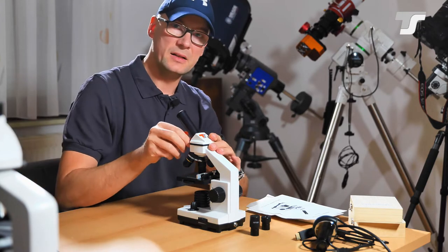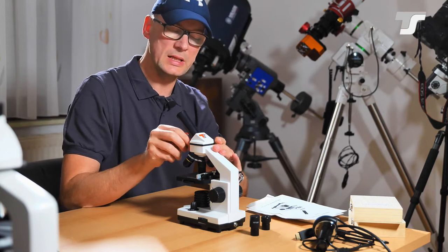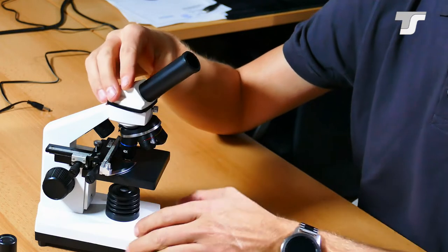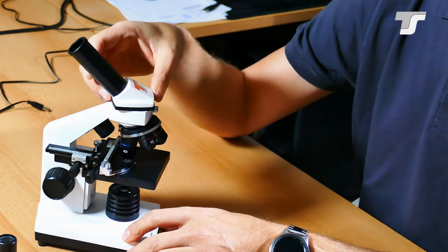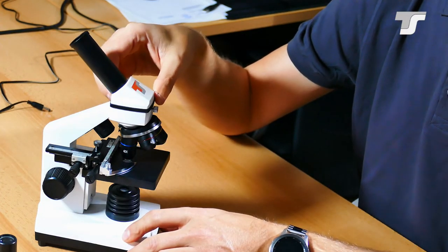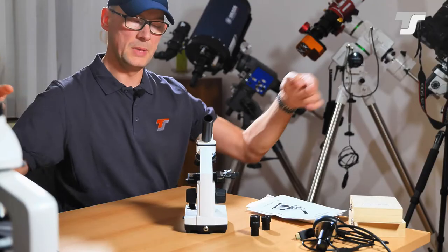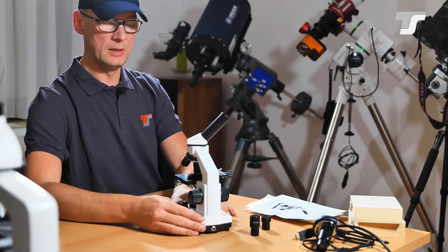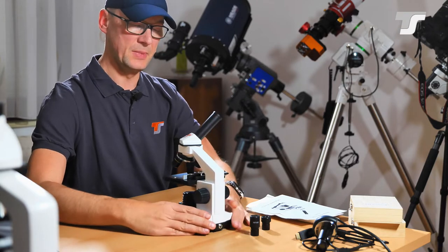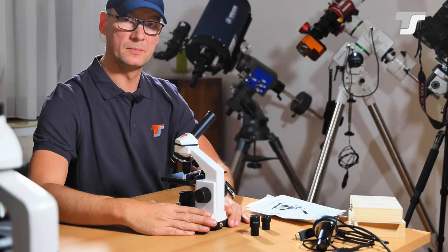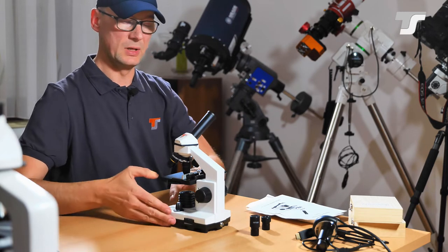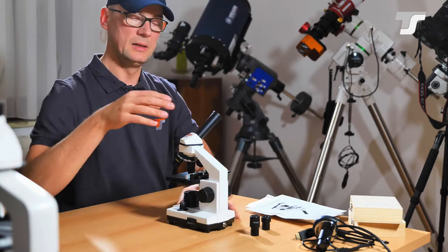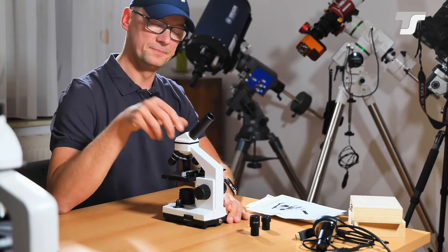The head of the microscope is turnable. When loosening this lock screw you can turn the head of the microscope. For example if there are many people standing around your table then you can just turn the microscope. You don't have to turn the microscope itself. Then it will catch different light or something. So this is not working that good. But by turning the head you're good to go.